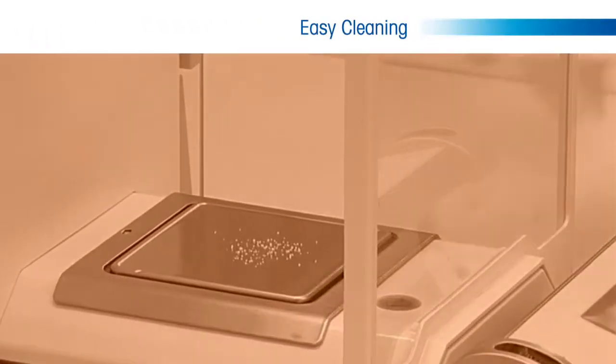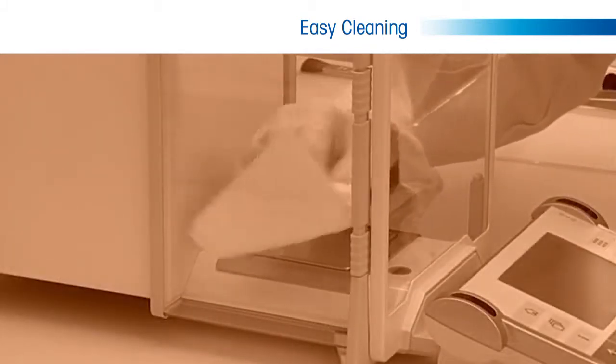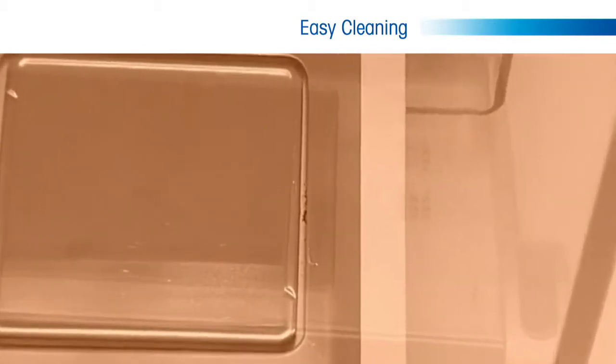One of the many challenges balance users face in weighing is cleaning of the balance. This can be an issue during the weighing process when a substance is spilled in the weigh pan and must be cleaned to avoid affecting the weighing result.